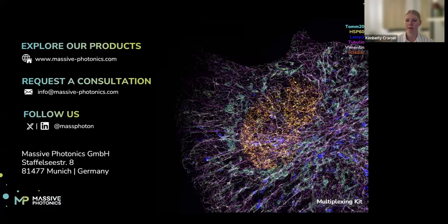And here we needed, for example, to amplify the signal using DNA paint in a certain way. The most important is that you're able to clearly see your target, and you can also design the imagers in a way where they won't bind to this genomic DNA or RNA, as well as do increased blocking. It's something to always consider when looking at RNA or DNA, especially within the nucleus. But so far with RNA, it has not been an issue for us.